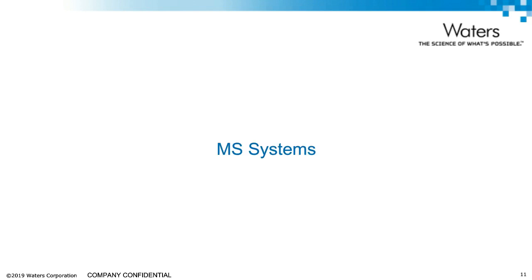Now, let's speak about the components comprising or common to any mass spec system.